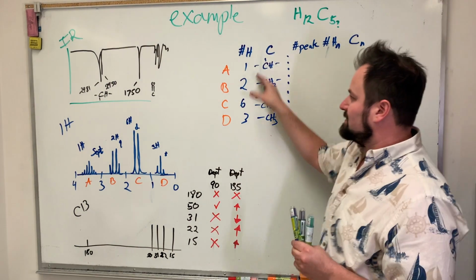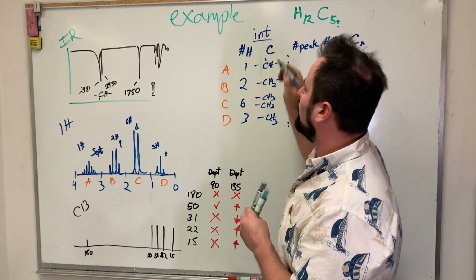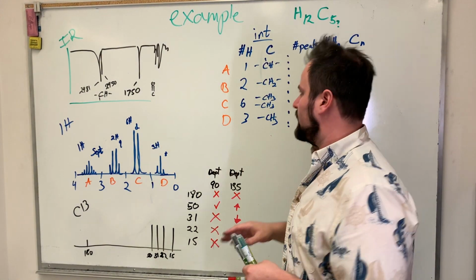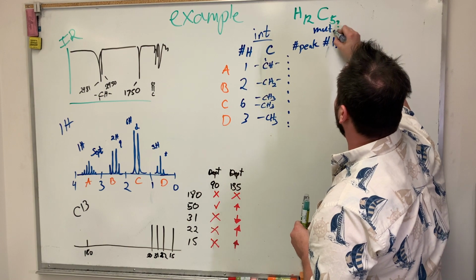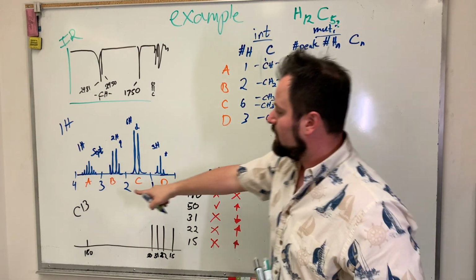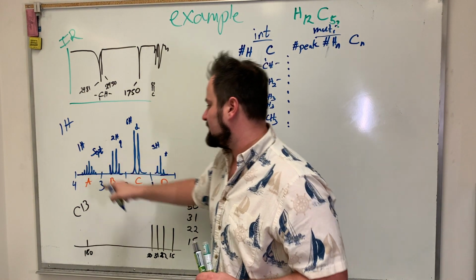Remember, this is integration. Integration is part of what is actually on that peak. Then, looking at this quickly for multiplicity, that's what all of these are. Multiplicity for the first one, here we have 1, 2, 3, 4, 5, 6, 7 peaks. It even says they're septet.